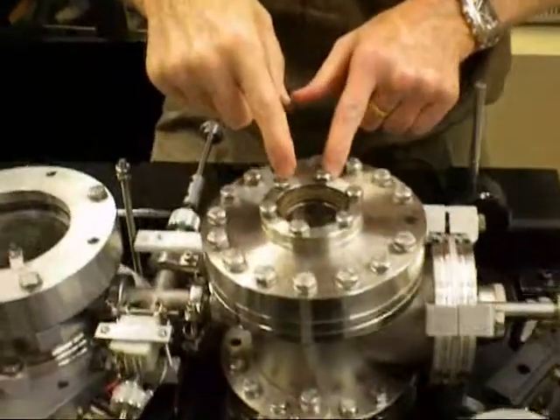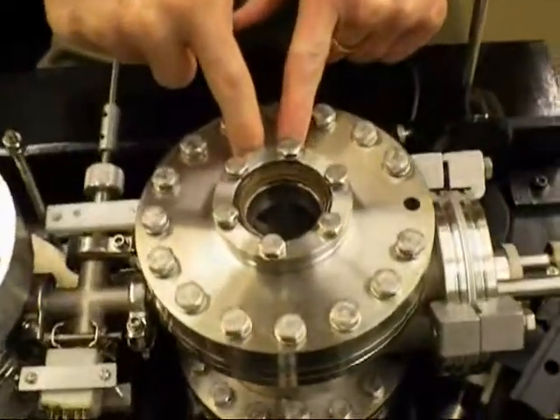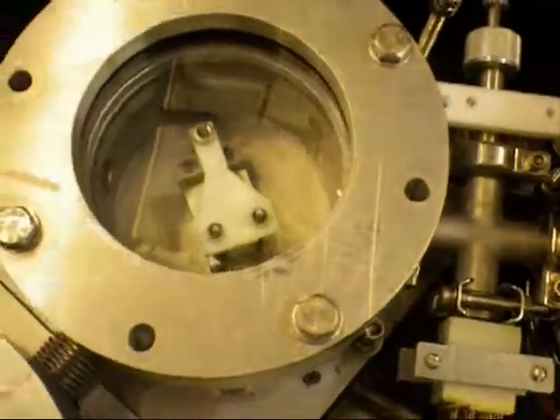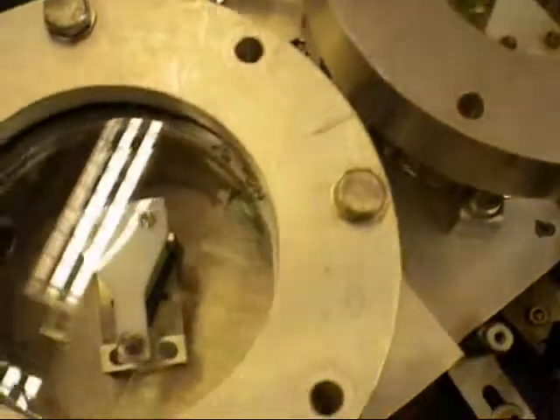So this is, as I said, the output coupler is just in there. These are the tuning prisms, and you may be able to see the light from the pump laser, that green light on there.